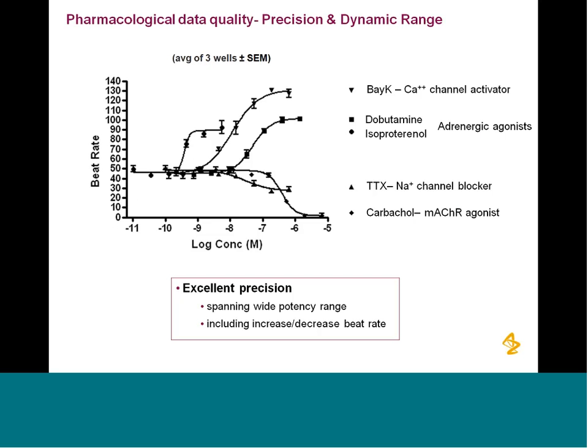Right, so then our normalization, and this came from discussions with Liang Gao, who was at Roche at the time, and we both observed, and he was using mostly the human cells, we both observed that the beat rate was consistent from time 0 to time 20 minutes or 2 hours.